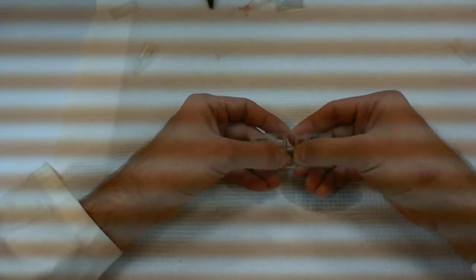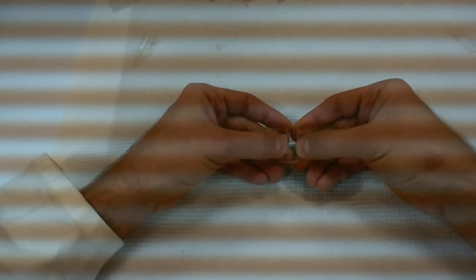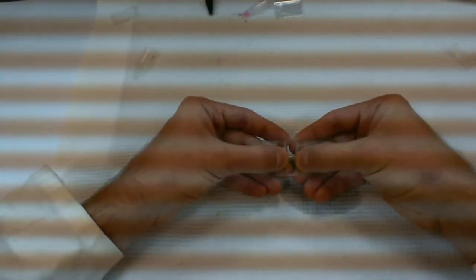Okay, so the more water you put in here, the longer this is going to take. The less water you put in here, the less it's going to take. What you're trying to do is basically just move it back and forth until this cover slip doesn't want to move very much anymore. Once it starts to give you resistance to movement, it's probably attached fairly well.